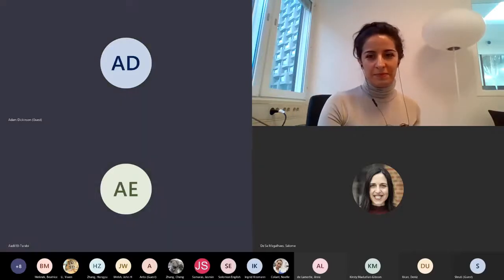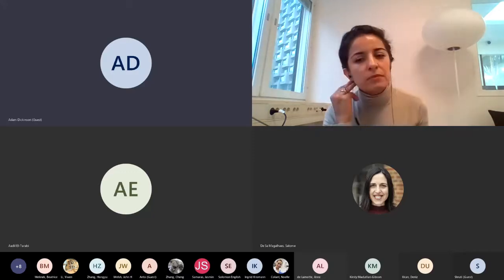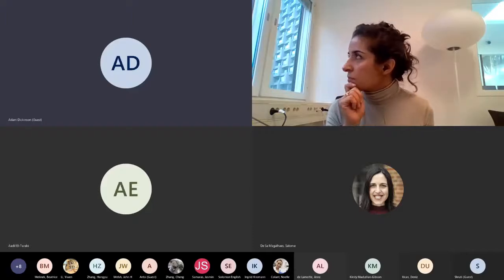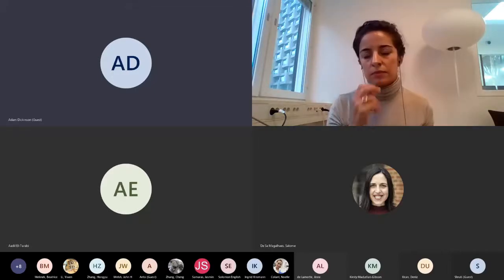Yeah, that's a tough one. I think the biggest challenge is whether you can reliably identify those particles yourself, because that's what the CNN ultimately relies on: our input to say this is what I'm interested in, this is what I'm not interested in. As an example, I was trying to identify some subunit-like particles in those last images.